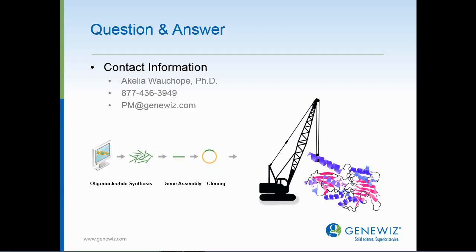Thanks, Akelia. Our next question deals with protein tagging, and it is, what options do I have if I want to add a tag to an existing protein, and do I have to resynthesize the entire nucleic acid counterpart?